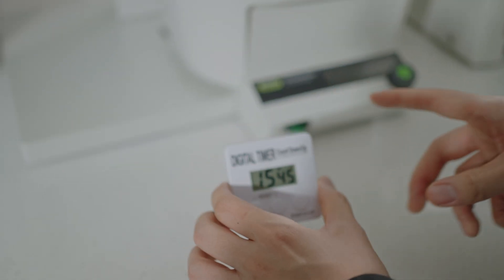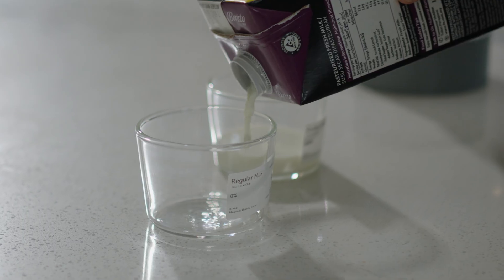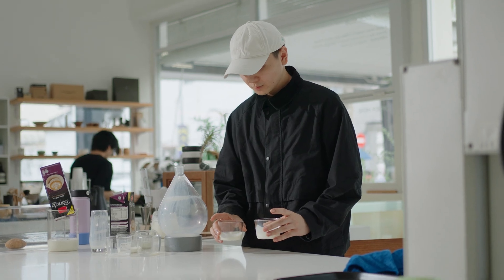One thing I really like about the special sensors here is that I don't have to worry about my sample dirtying the condenser due to foaming. With the Viukey Rotor Vapor, we are able to achieve the same result as freeze distilled milk much faster and more consistently. We have prepared two types of milk — one regular and one distilled — so let's find out what our customers think.